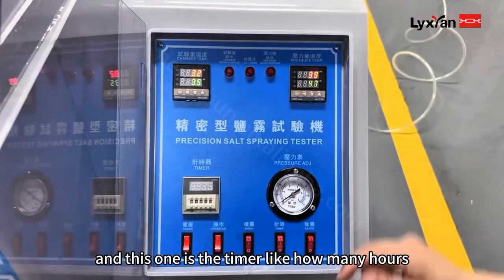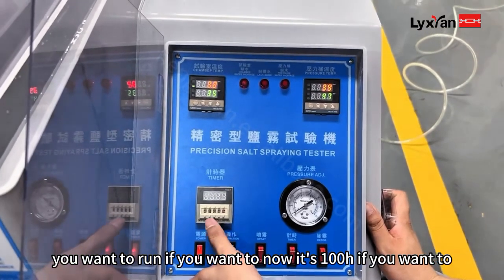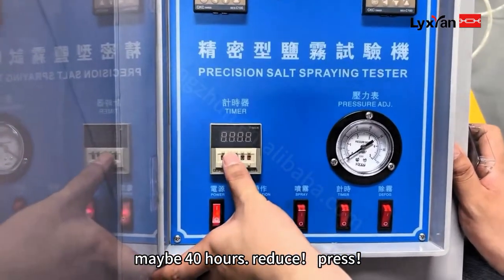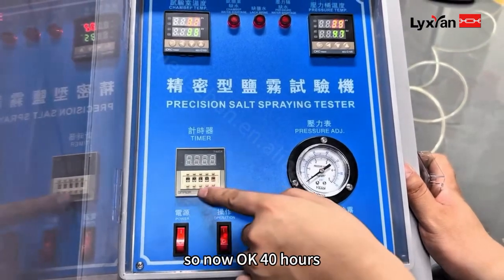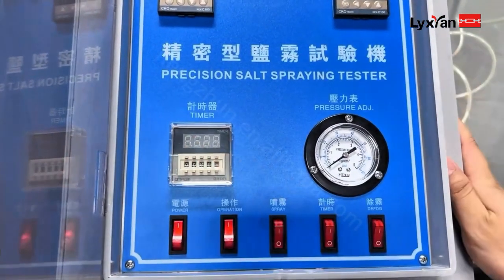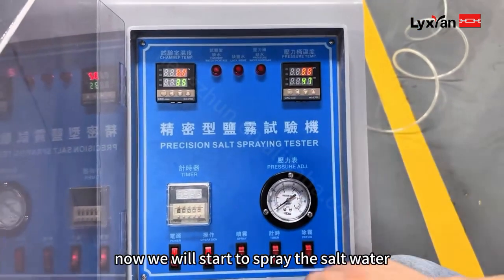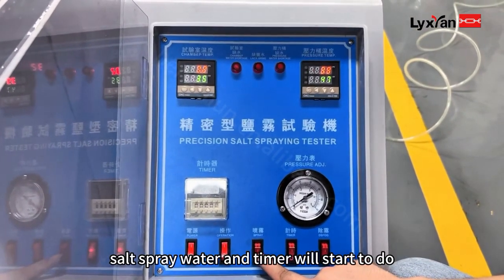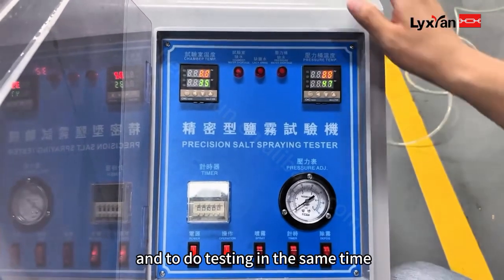This display is for the chamber timer — how many hours you want to run it. Currently it shows 100 hours, but you can set it to, for example, 40 hours. The temperature is set to 35 and 47. Now it will start to spray the salt water. The spray, the fog, and the timer will all start the testing at the same time.